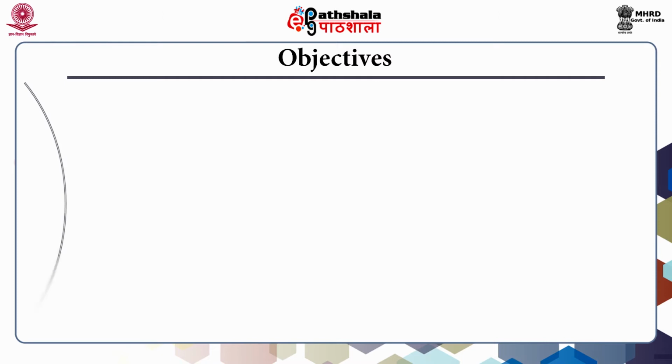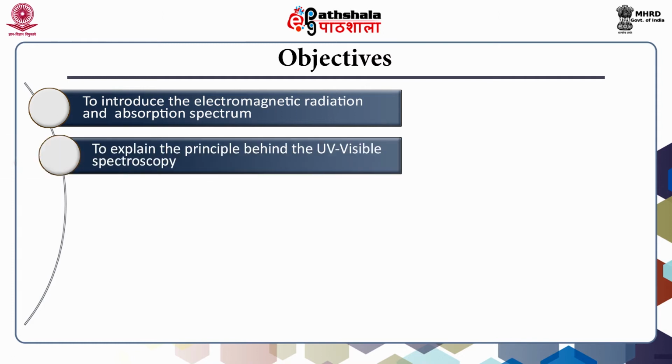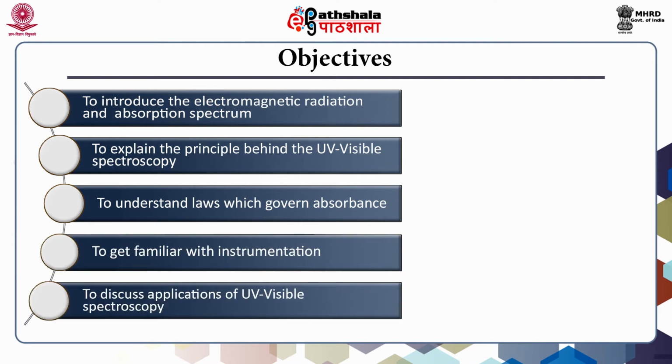In this presentation, I will be covering all aspects of UV visible spectroscopy, including electromagnetic radiation, electron excitation from one orbital to another orbital, laws governing light absorbance, instrumentation and applications of this spectroscopy.